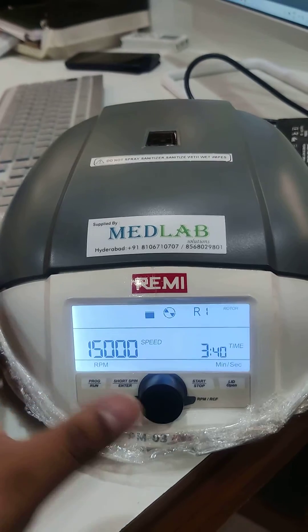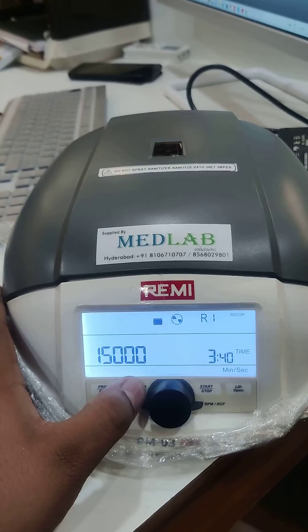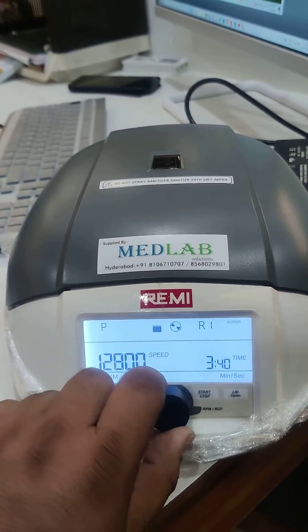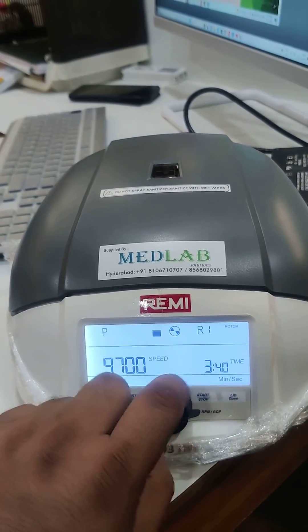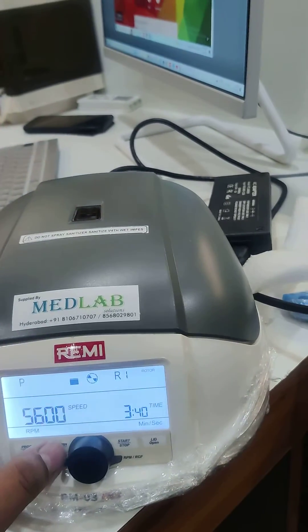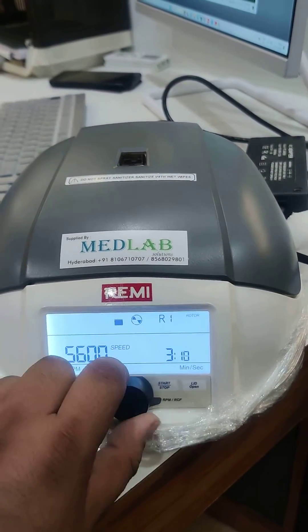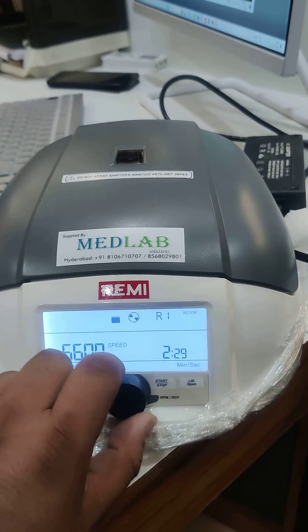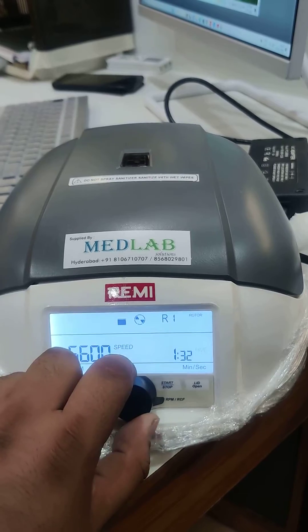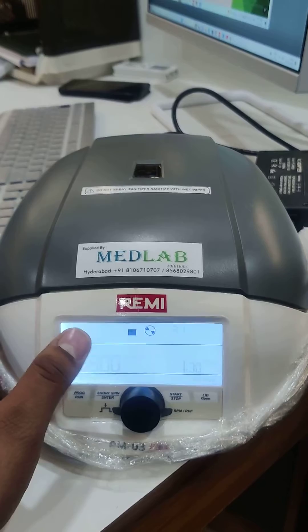To reduce the RPM and time, click on Program, then click on Short Spin, then click again and 15 will pop up. Reduce the RPM to 5000 RPM, then set the timer to 1 minute. You can set the time to 1 minute 30 seconds, then click on Program again, and this P1 will get saved.